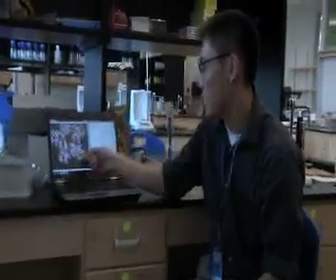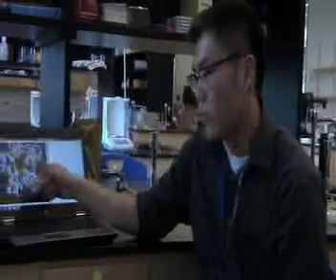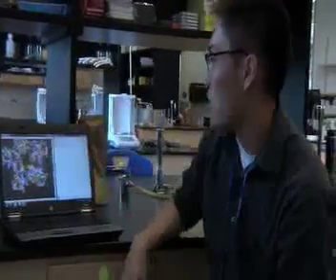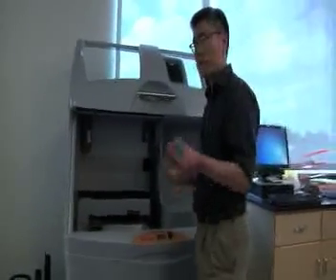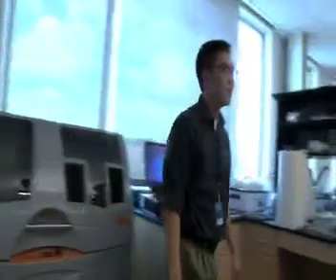This right here is a protein modeling project. The software I'm using is called RasMol, and it allows me to take protein files and create different models. This is a Shiga toxin, and I've been working with the B pentamer of the Shiga toxin, modeling that, and working with the amino acids on that. Once I finish this model, I can send this digital file to this printer, which can create actual 3D physical models like this, and I can use this as a model for other students and other projects.